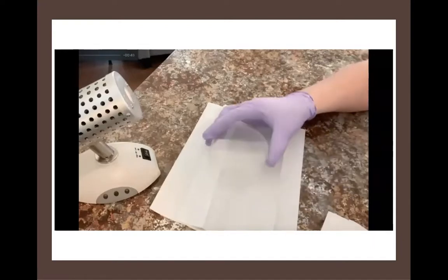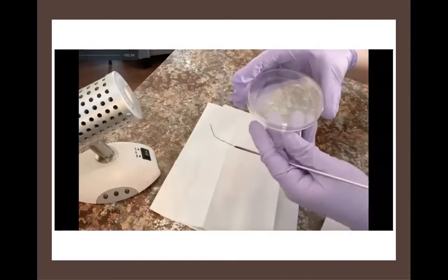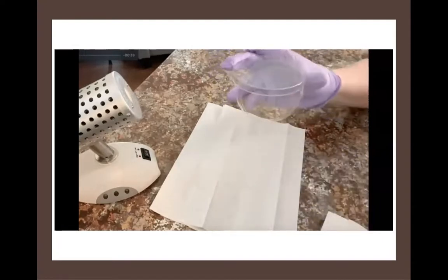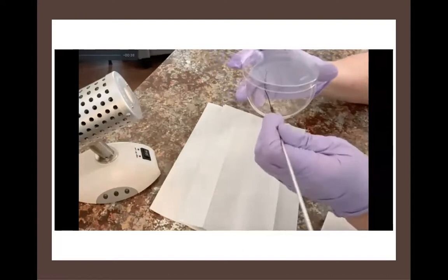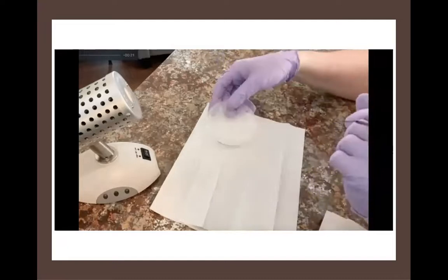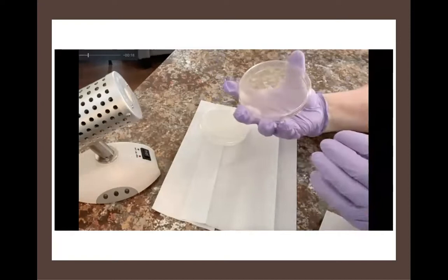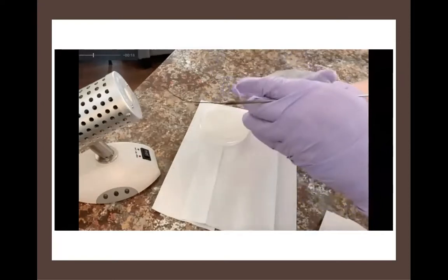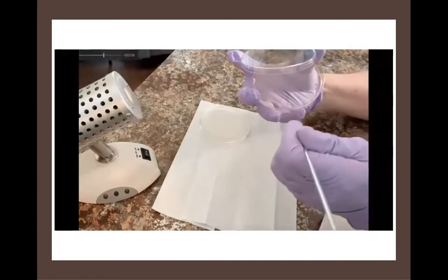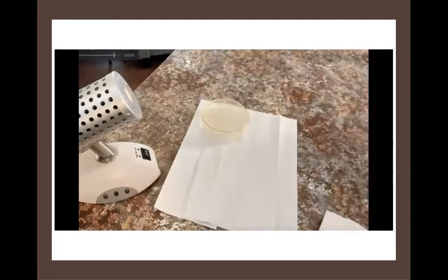Here's an agar plate that's being held right side up. And in this technique, we're going to use the lid to keep the plate partially covered. See that? I can reach in between with my loop and do my streaking pattern, close it, and then put it upside down. Let's look at that again. I'm going to keep the plate right side up, use the lid as partial protection from microbes falling onto it, streak it, close it, back upside down.